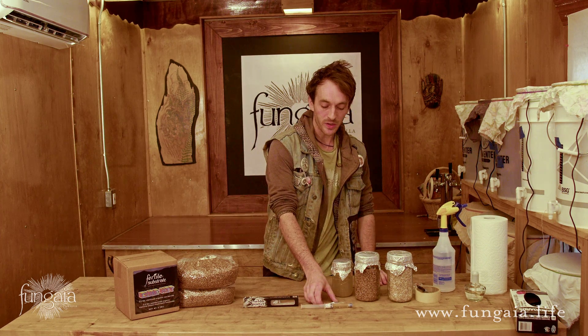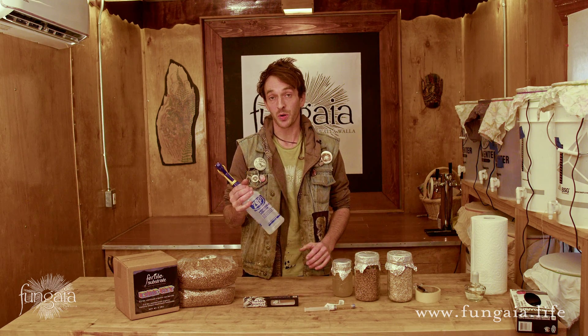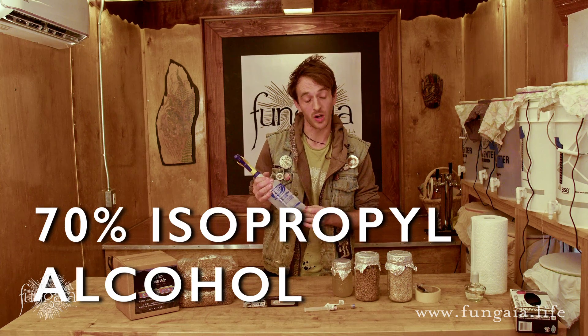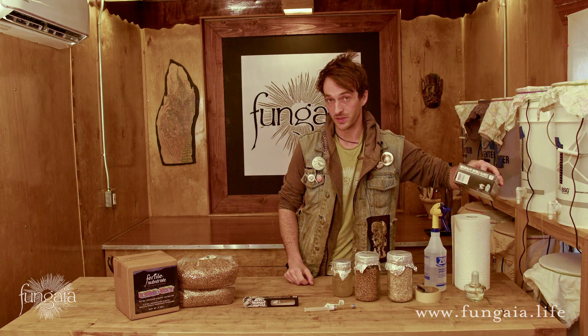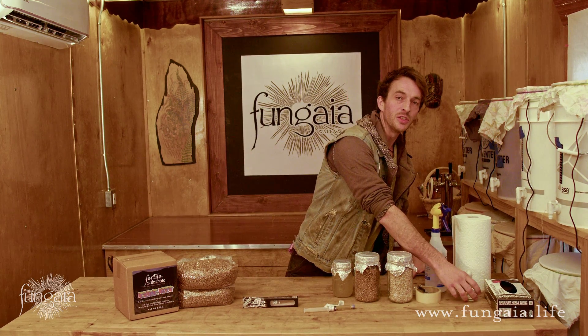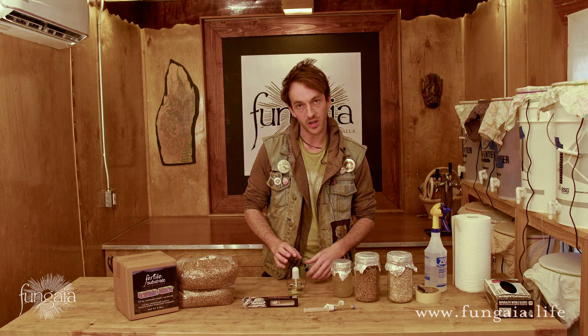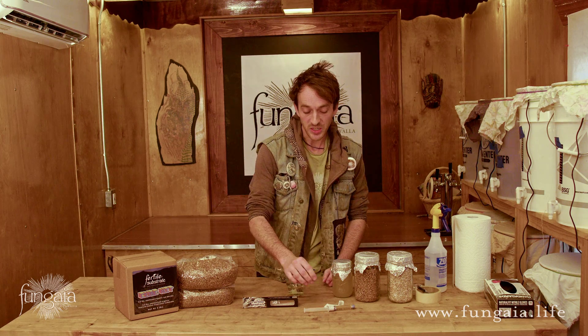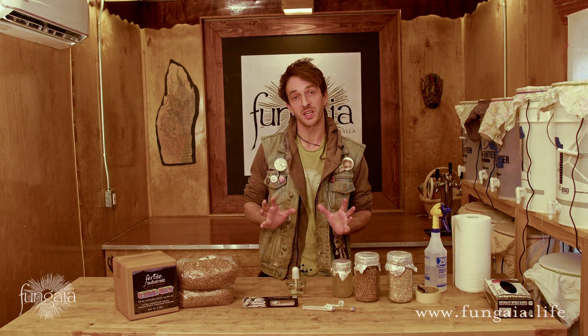There are a couple of other things I find very helpful for this process, though none of them are necessary. Your syringe should come with an alcohol swab, but you might as well invest in a spray bottle filled with 70% isopropyl alcohol and a roll of paper towels. It's also never going to hurt to put on some nitrile gloves. I always really like to use an alcohol lamp when I do my inoculations — the rising heat of a working flame creates a local sterile environment. It's not necessary, but it will increase your chances of success, and it's especially important if you want to save part of the syringe for later or if you're working with agar plates.